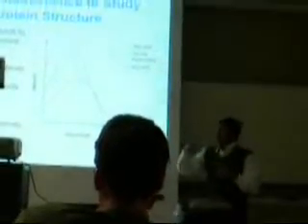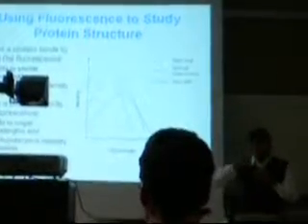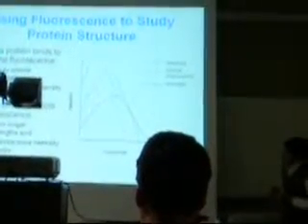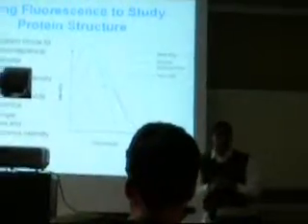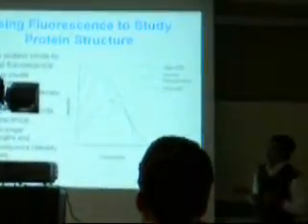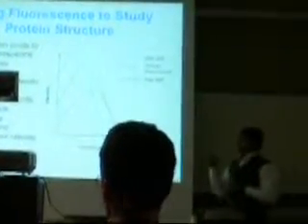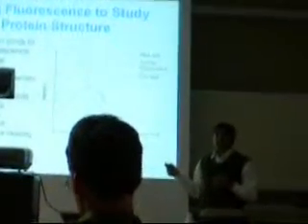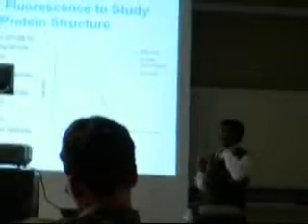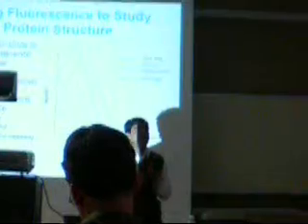That means we have fluorescence shift to the longer wavelength and decrease in the intensity of the fluorescence. So this is an important key point. This will help you interpret my data that I will show you later on. So when we have a blue shift, high intensity, and shift to the shorter wavelength, that means our protein and lipids are interacting.